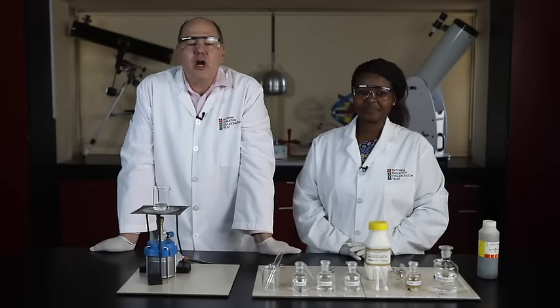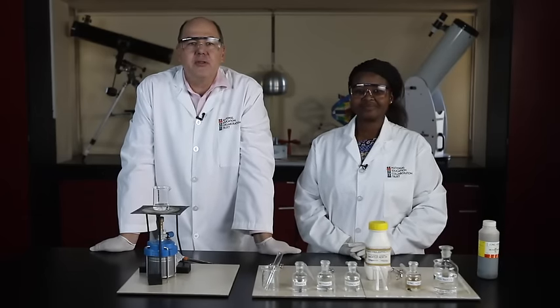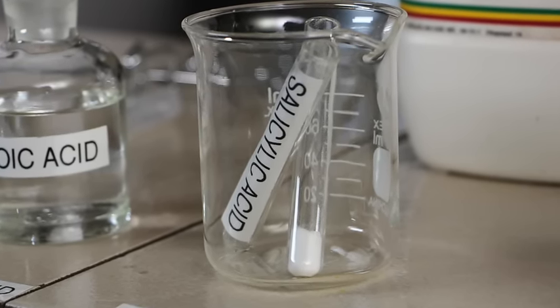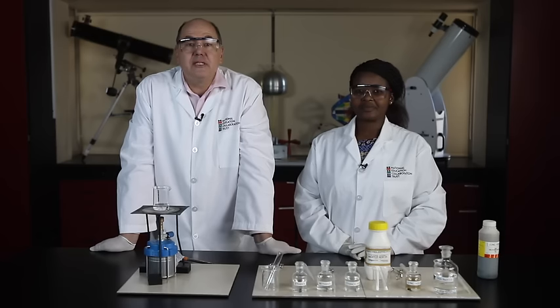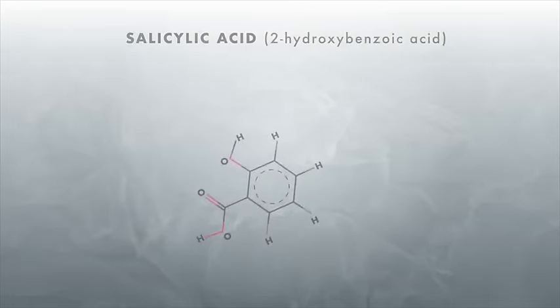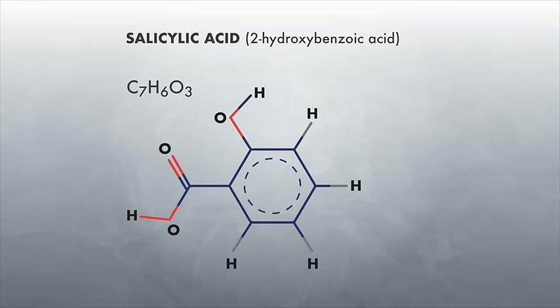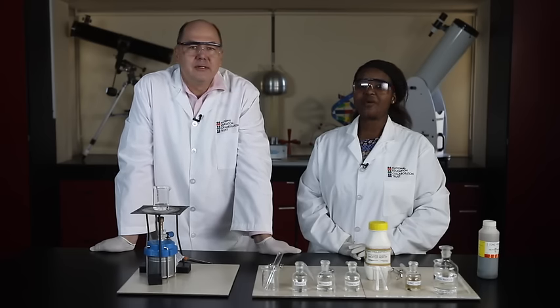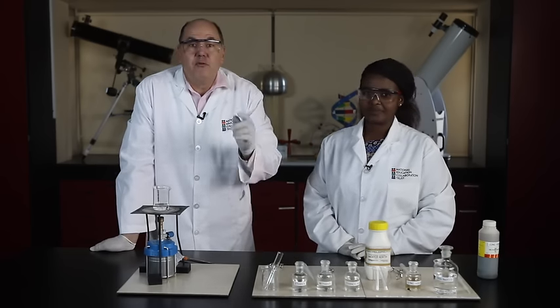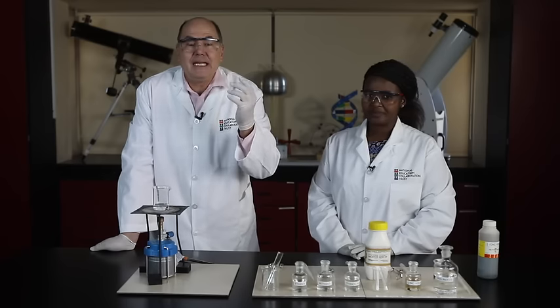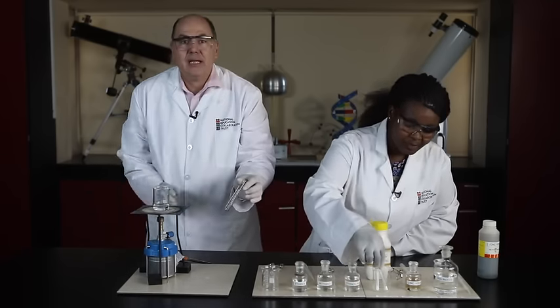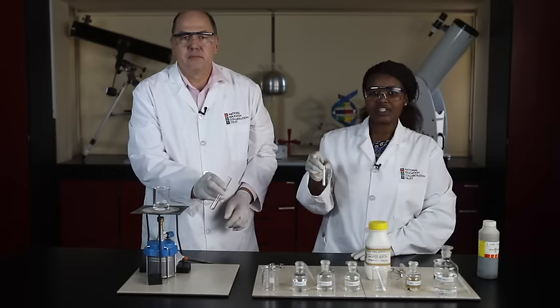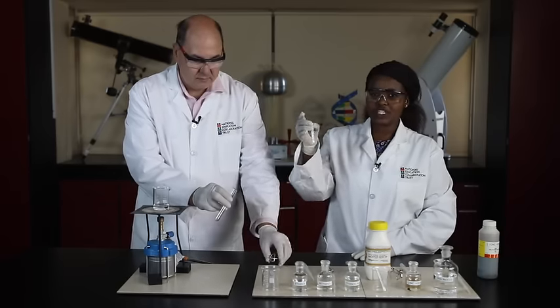This time we use a crystalline carboxylic acid and react it with methanol. Salicylic acid is a crystalline solid. Its IUPAC name is 2-hydroxybenzoic acid. Here is its chemical formula. When we work with a solid acid, we need to change our method slightly. Of course, we first start with a dry, clean test tube. Here it is. We have measured 0.5 grams of salicylic acid to use in this reaction. So we'll add the salicylic acid to the test tube.